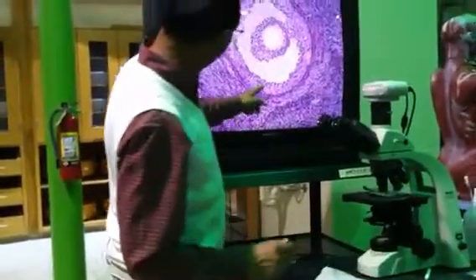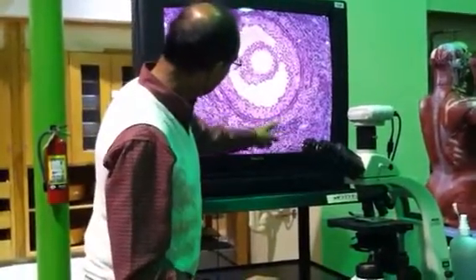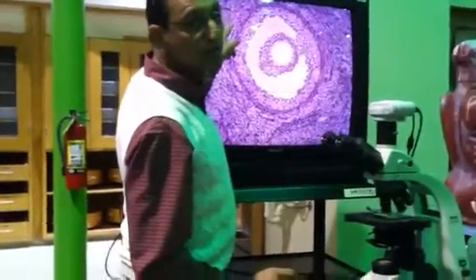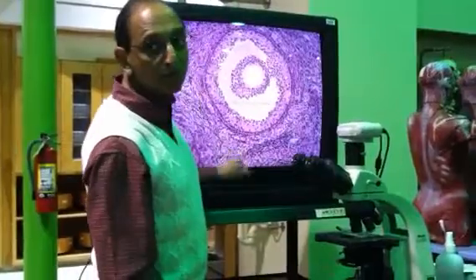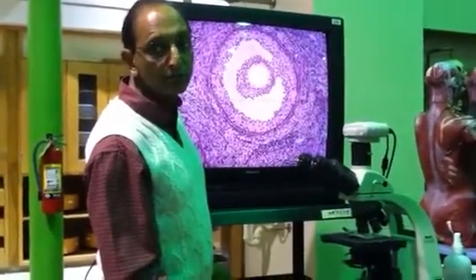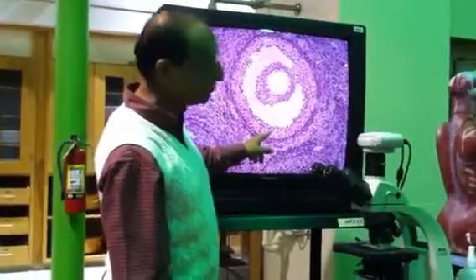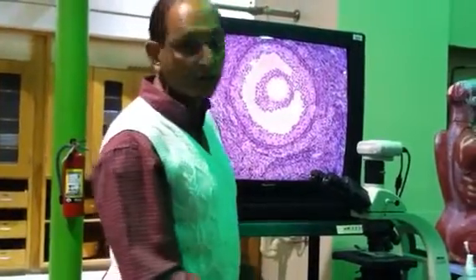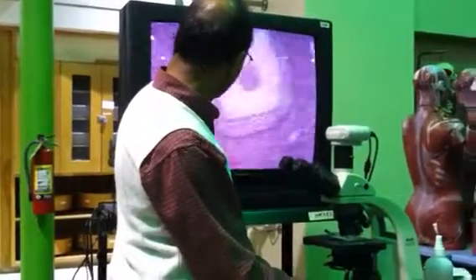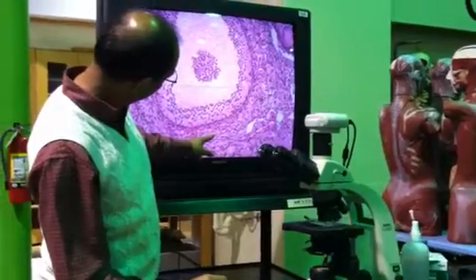This is very nice. Granulosa. And what is this outer layer? Theca. Okay. Can you show that one more time? Show what? The granulosa, the first one. Granulosa. So which one is this? Granulosa. Theca. Okay.